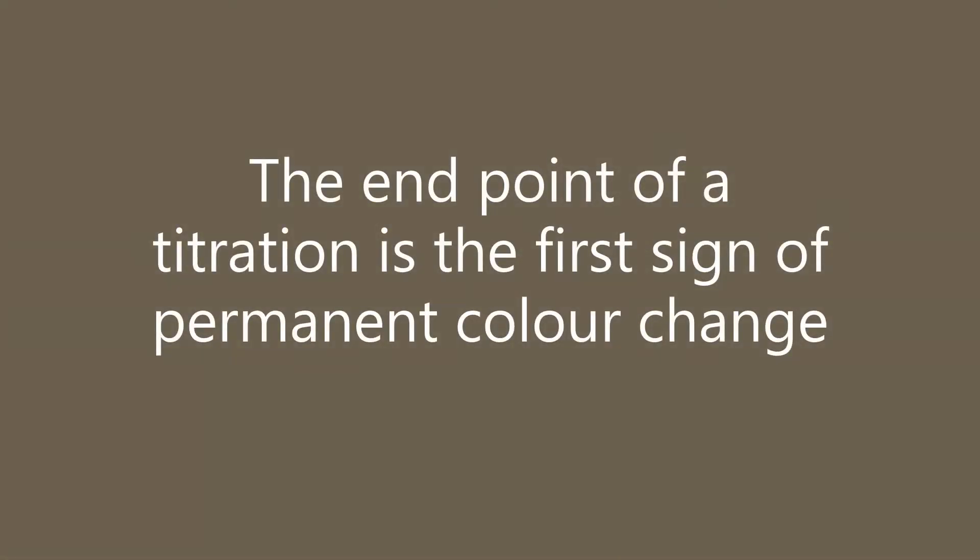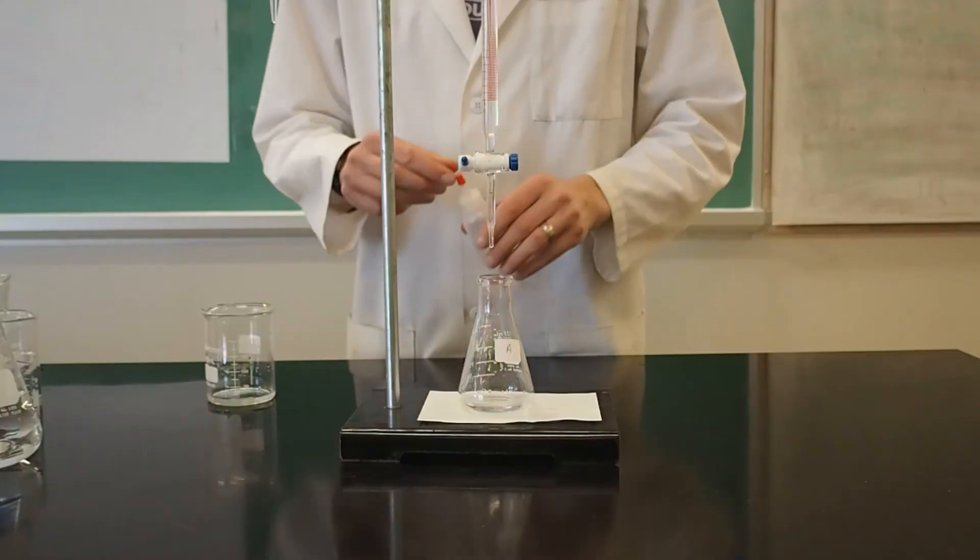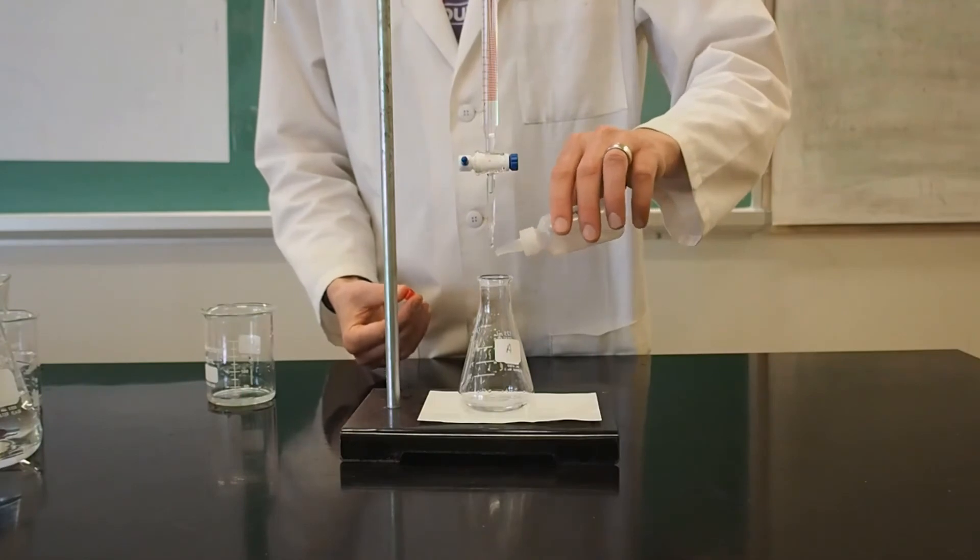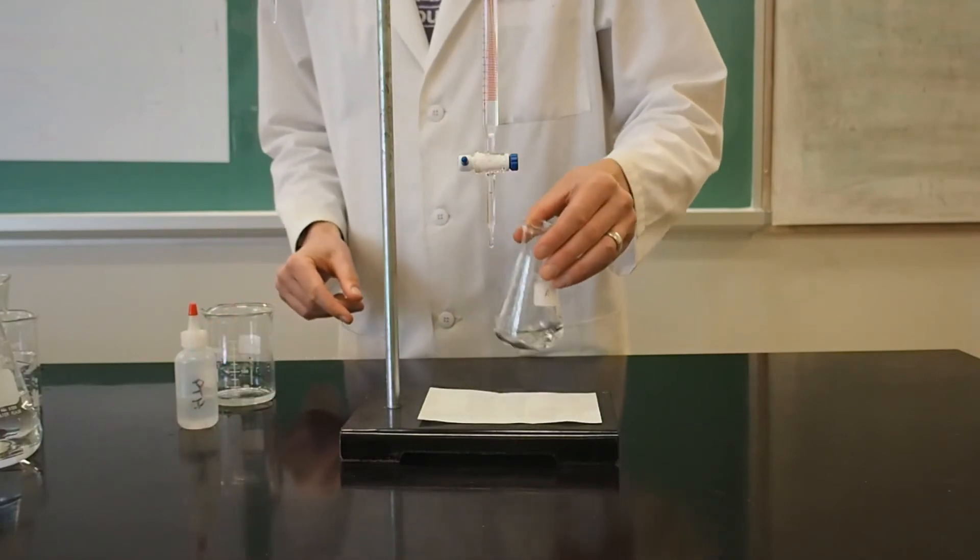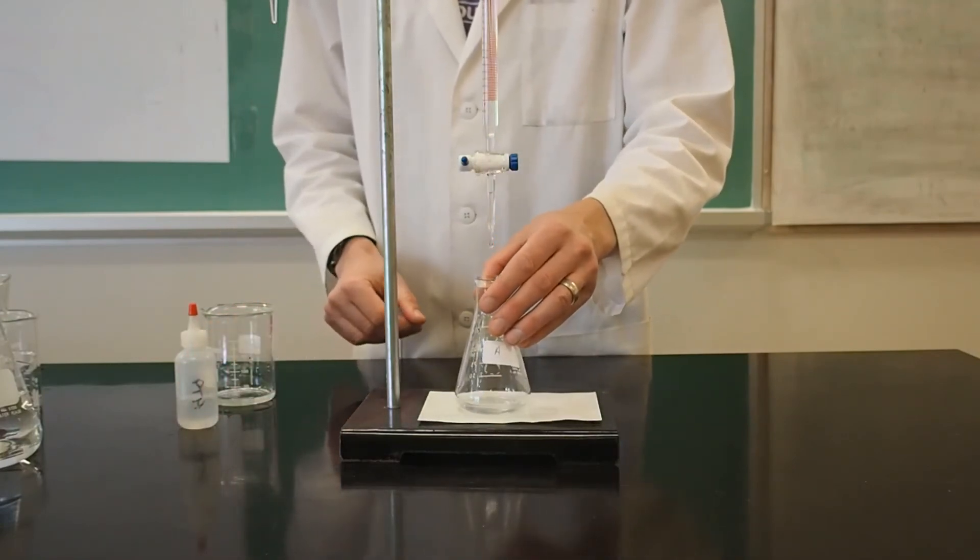In an acid-base titration, we will carry out a neutralization reaction and we will use an appropriate indicator to let us know when the reaction is complete. The end point of a titration is the point at which the indicator first changes color. The specific indicator that is used is the one for which the end point is very close to the equivalence point for that specific acid-base reaction carried out. Add two or three drops of the indicator to the flask or the amount that's asked for in the experiment instructions. Swirl the flask to incorporate the indicator.